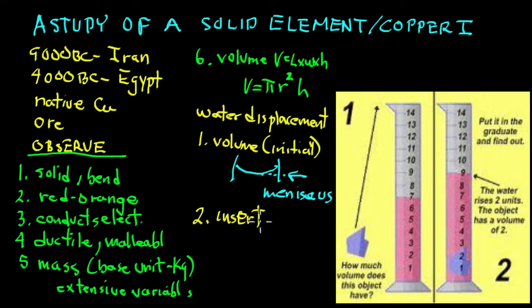Very carefully so you don't break the cylinder. And make sure the object doesn't dissolve in water, or you couldn't get the volume. And look at the reading, this volume two.